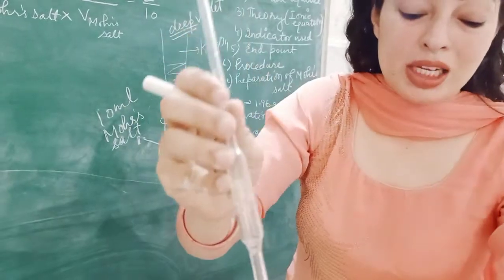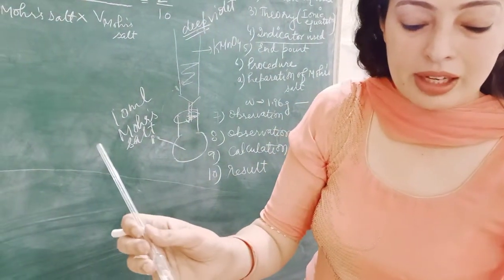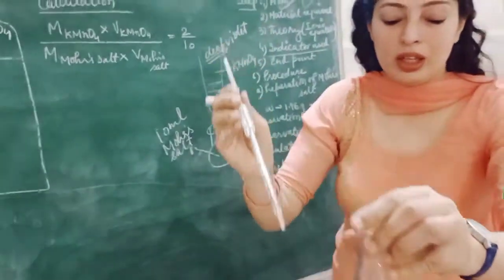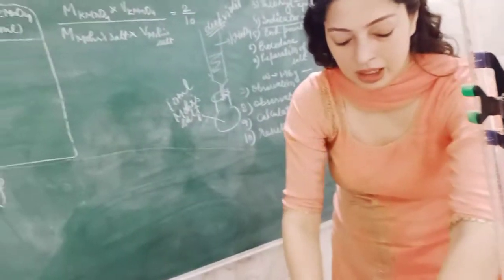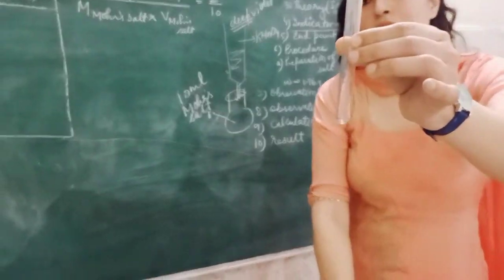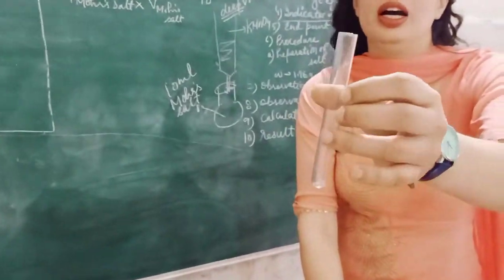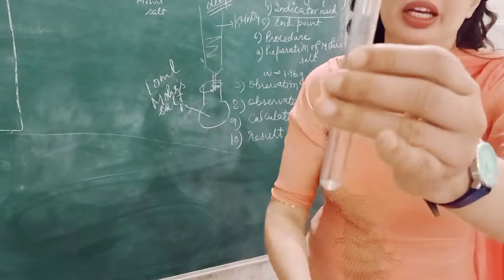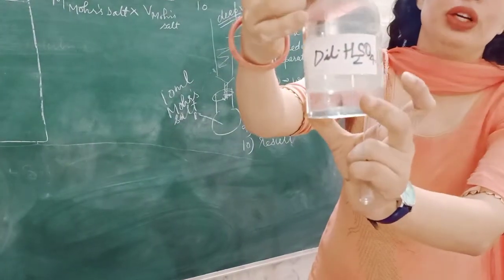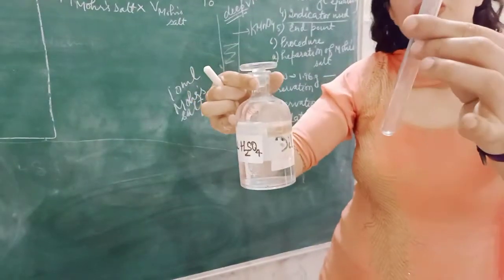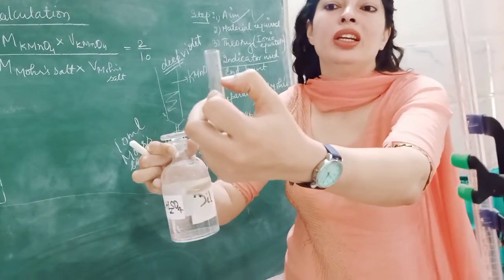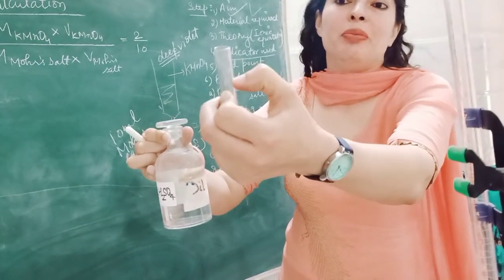We will transfer the liquid to the conical flask. You will transfer 10 ml of Mohr salt to this flask. After that, with the help of a test tube, you will add dilute sulfuric acid — this is called dilute sulfuric acid.